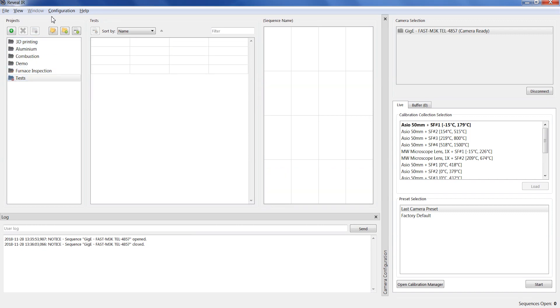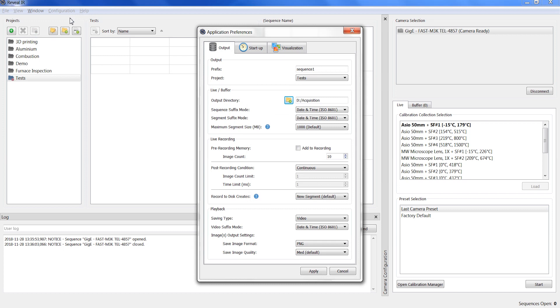It is important to know that the recorded or exported sequences location on disk is not defined by the project but is specified separately.